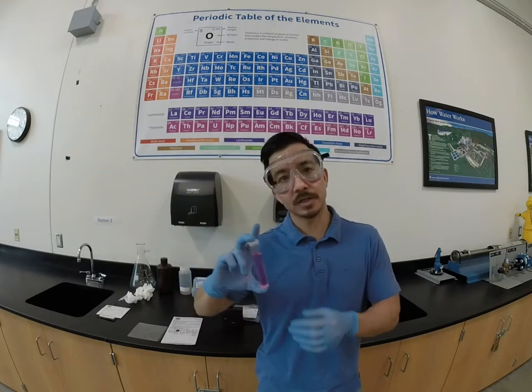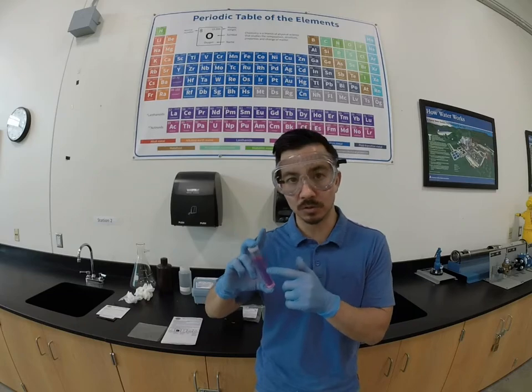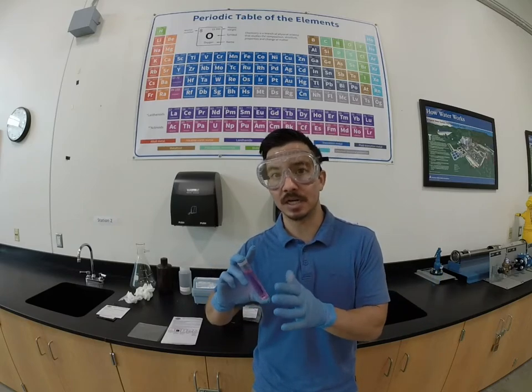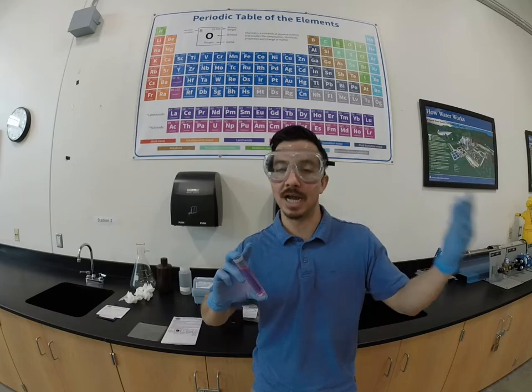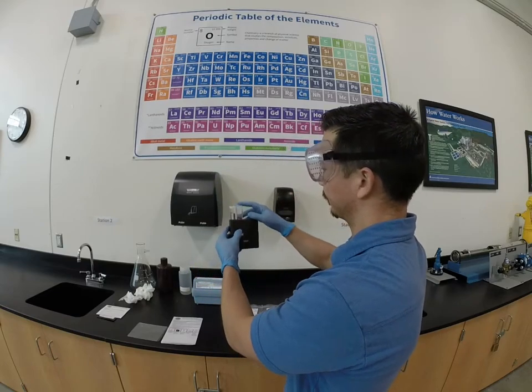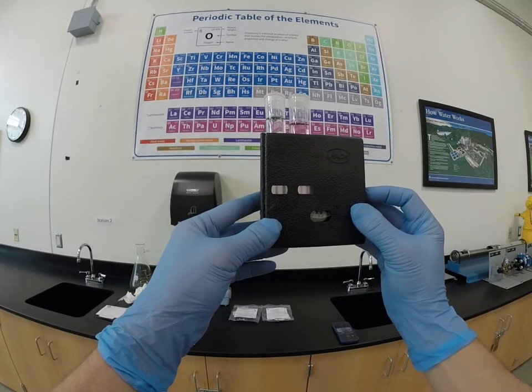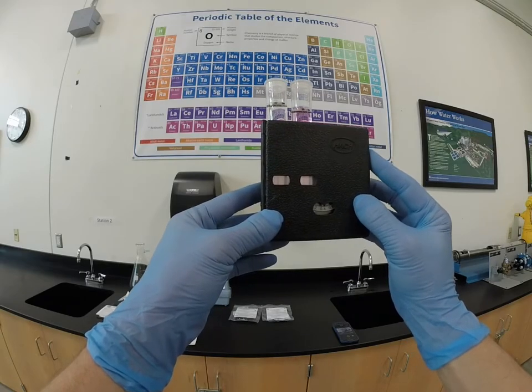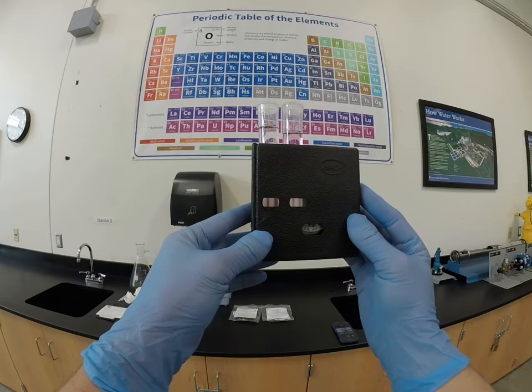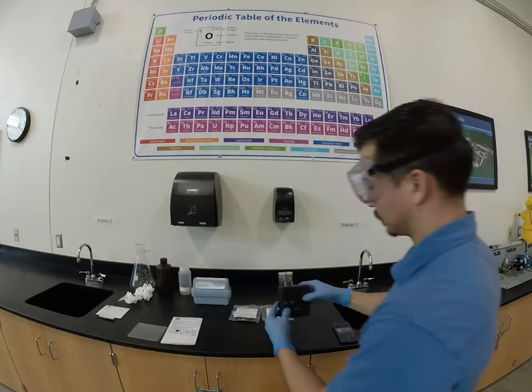This is a second water sample. Instead of adding the free chlorine reagent, I added the total chlorine reagent, so we're measuring total chlorine — chlorine that can be bound to anything as well. Seeing free chlorine is a good sign because it means the chlorine has not yet reacted with anything in that water such as contaminants or pathogens. Taking our total chlorine sample and placing it in the comparator, this one is definitely a little bit darker than our free chlorine. 0.4 seems a little light, 0.6 seems a little dark — so we're probably right at 0.5 milligrams per liter.